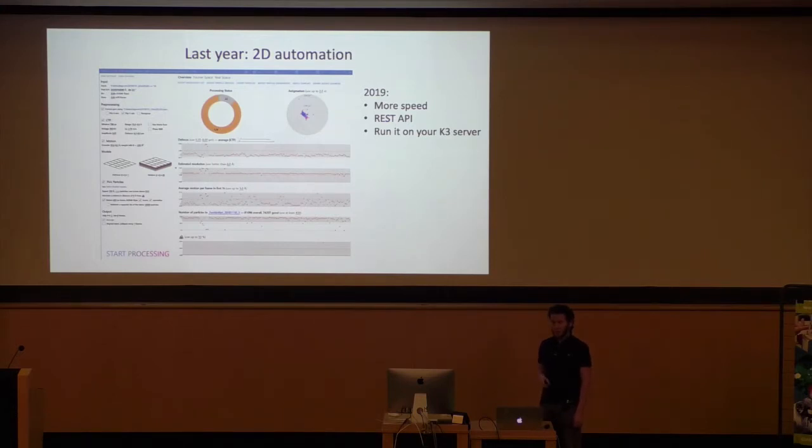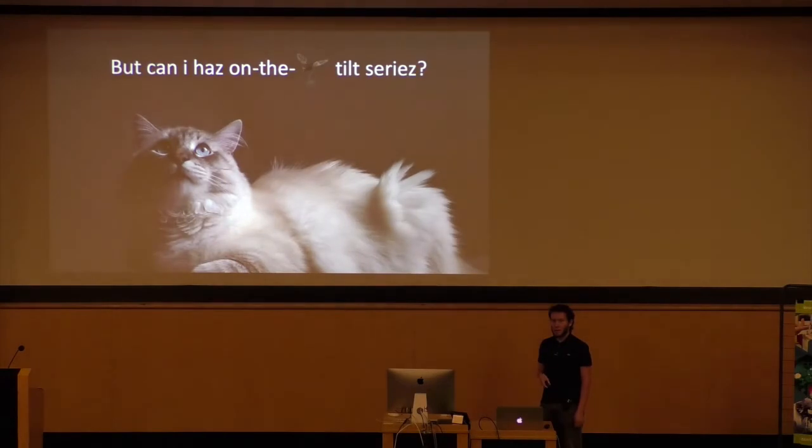I think this workshop this year is already trending more towards tilt series and tomography. And I hope I don't take too much away from the next session when I tell you that tomography is awesome. We should be doing it more. Now, my cat certainly agrees about that, and it really likes to chase flies. So it really wanted me to implement on-the-fly tilt series pre-processing in Warp.